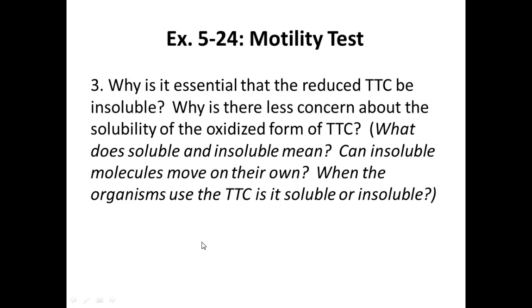Why is it essential that the reduced TTC be insoluble? What does insoluble mean? It's not soluble, it doesn't go into solution, right? So it stays right where it is, where it's been reduced, right? So what does soluble or insoluble mean, right? Soluble means it diffuses through a liquid media. And remember, this is semi-solid, so there's a liquid component to it. Insoluble, right, is when it's reduced, and so when the organism reduces it, it should stay right there next to the organism. So it's only helping us visualize where they're growing.